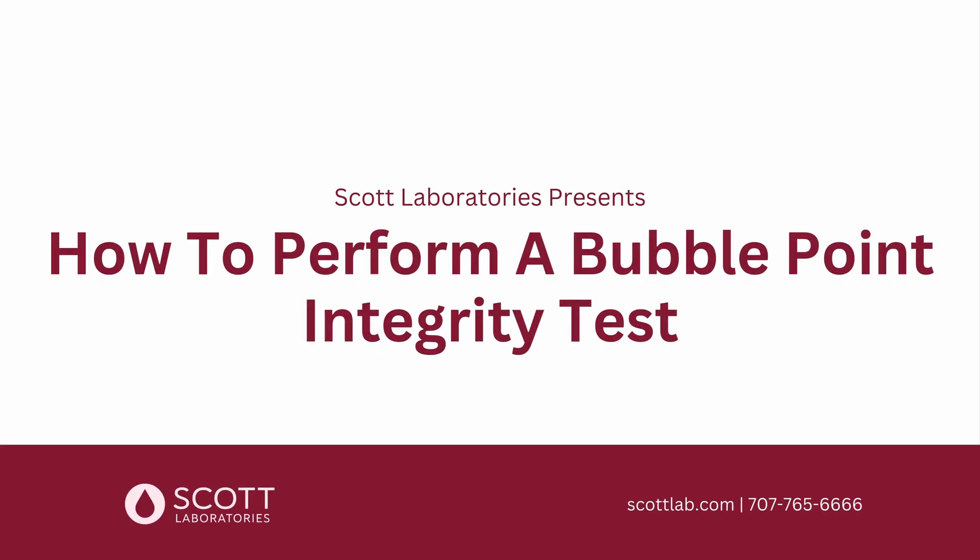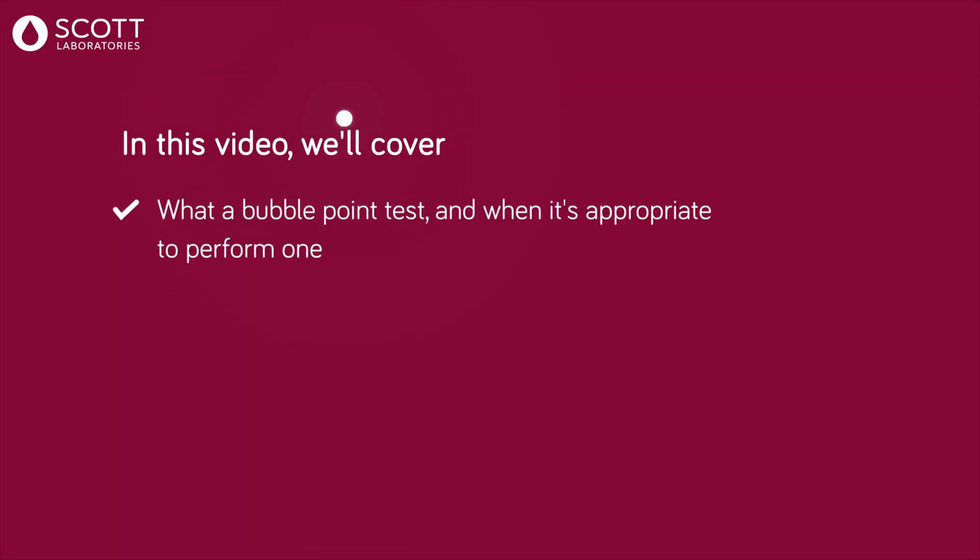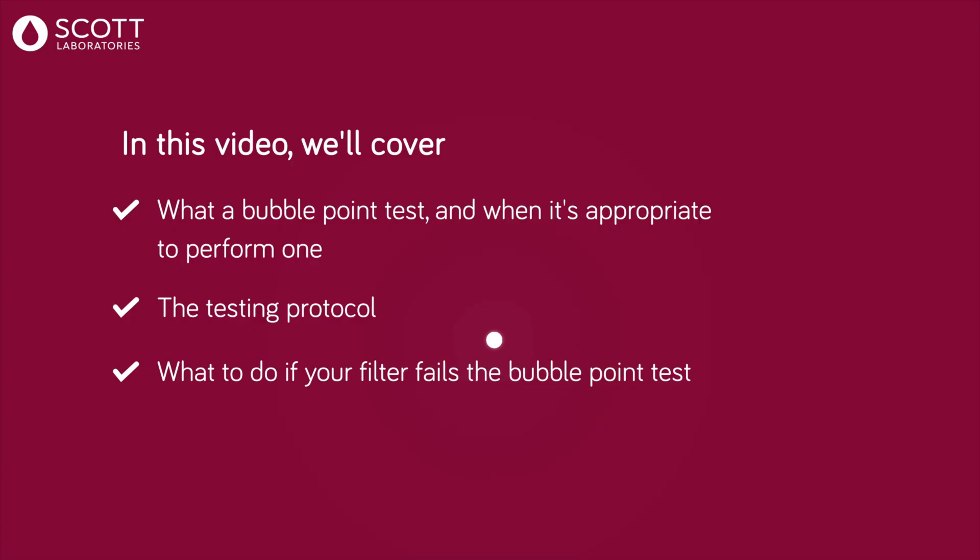How to perform a bubble point integrity test with Scott Laboratories. In this video, we'll cover what a bubble point test is and when it's appropriate to perform one, the testing protocol, and what to do if your filter fails the bubble point test.